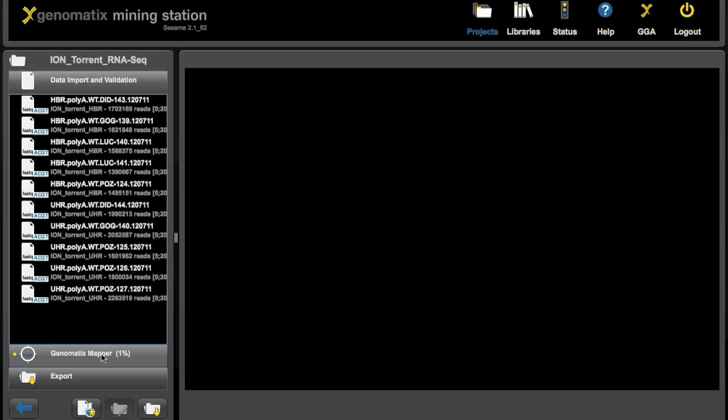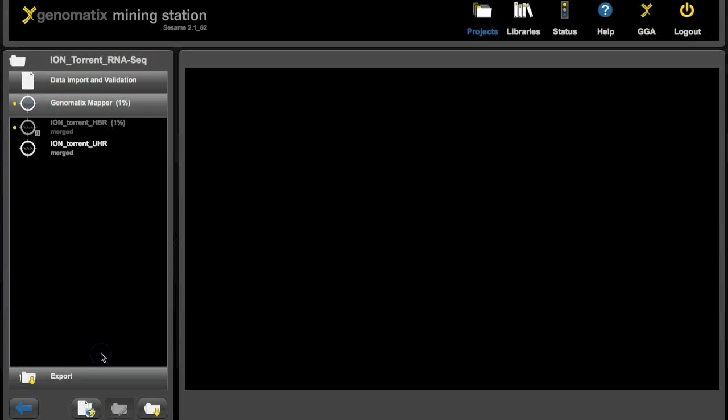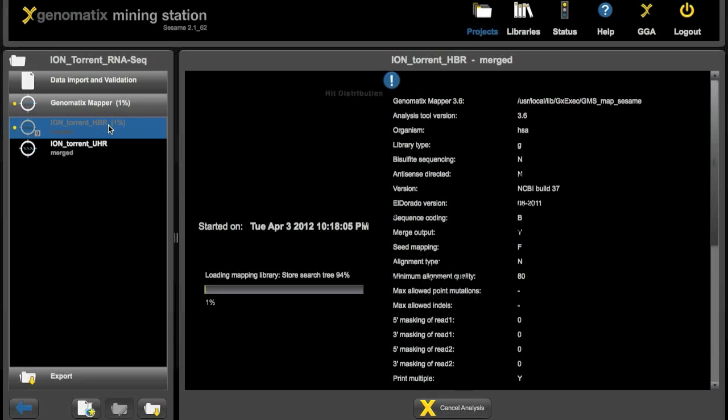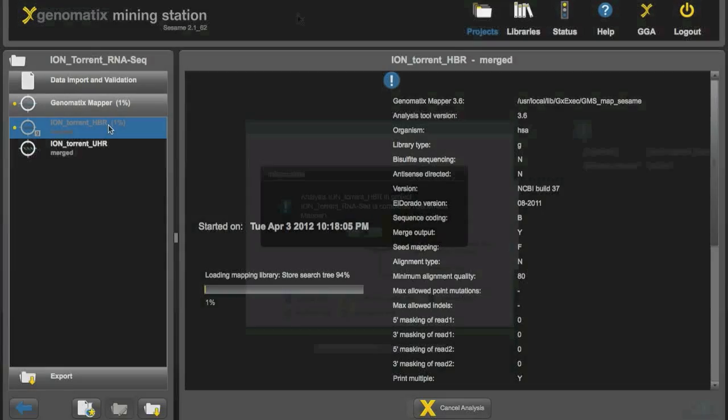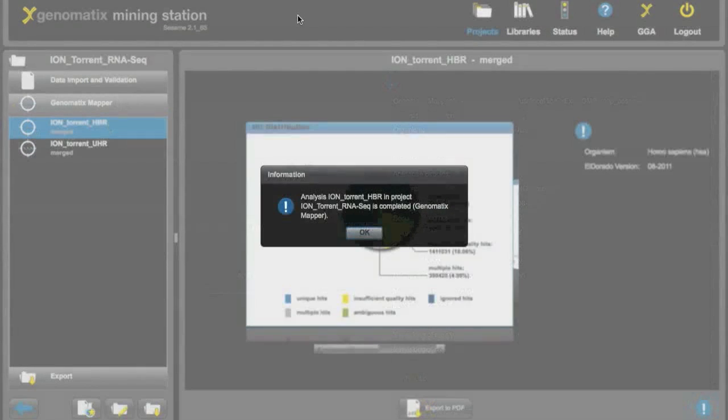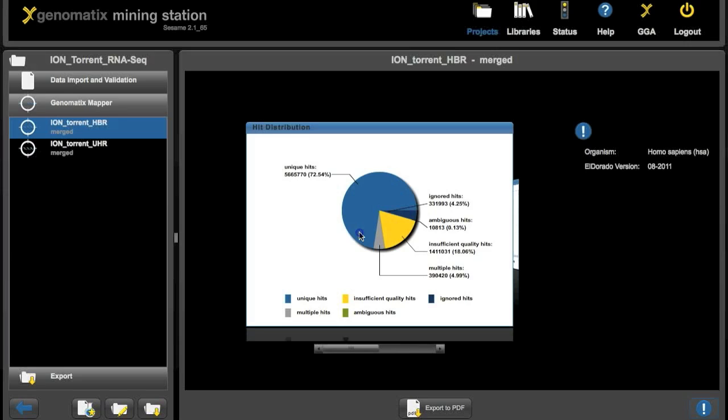Now let's switch back to the second analysis. This is now running and it is also at one percent. So we just skip to the end. Here it is done already. Again you can see most of the hits were mapped uniquely.